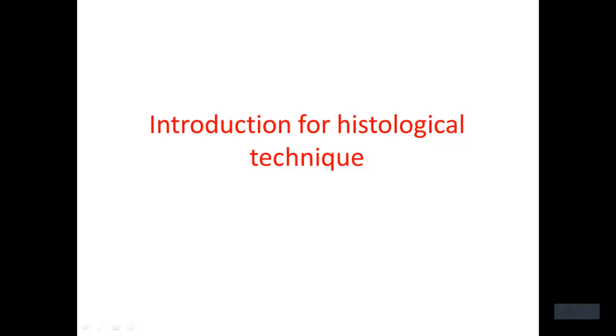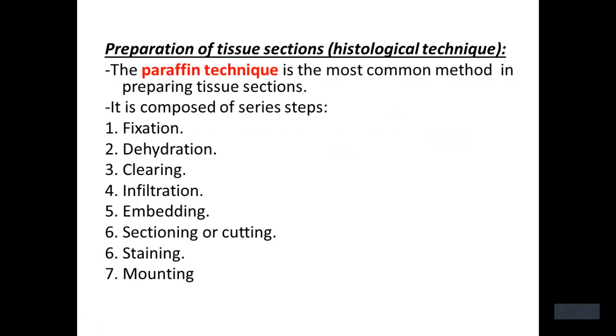Introduction for histological technique. This laboratory is the second practical laboratory for histology. Preparation of tissue section, histological technique. What is the meaning of the preparation of tissue section? By preparing the slide.